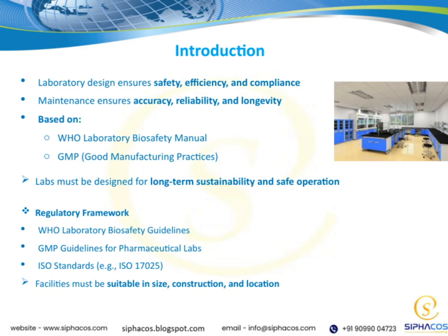Now, when we look at the regulatory framework, several standards come into play. The WHO biosafety guidelines provide essential safety practices, while GMP guidelines are vital, especially for pharmaceutical labs, ensuring quality and consistency. ISO standards, such as ISO 17025, set benchmarks for competence and technical requirements.